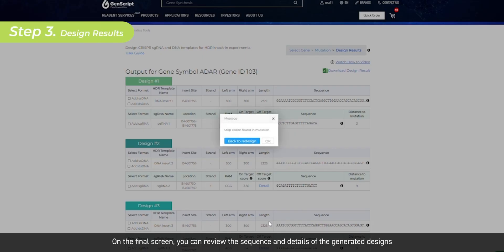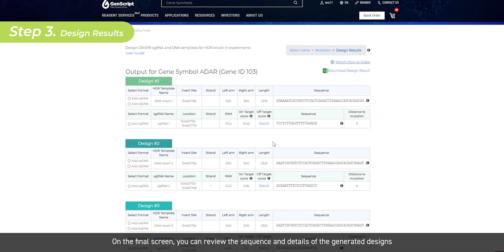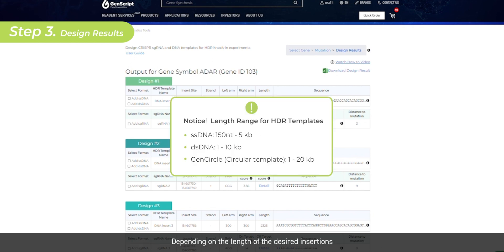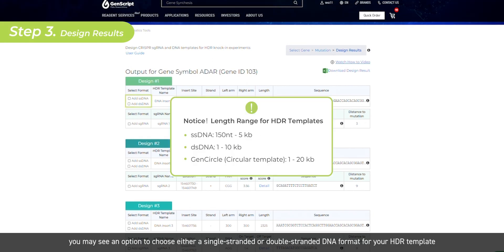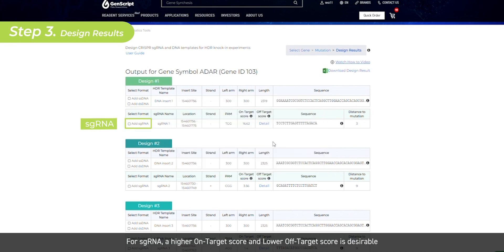On the final screen, you can review the sequence and details of the generated designs. Depending on the length of the desired insertions, you may see an option to choose either a single-stranded or double-stranded DNA format for your HDR template.